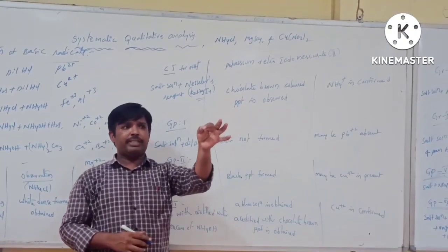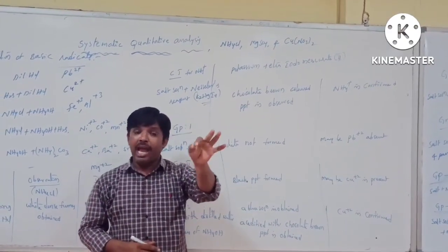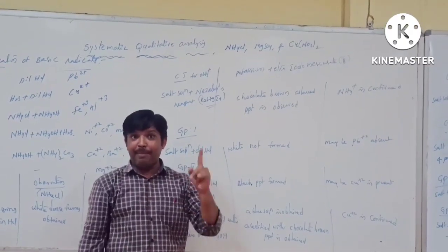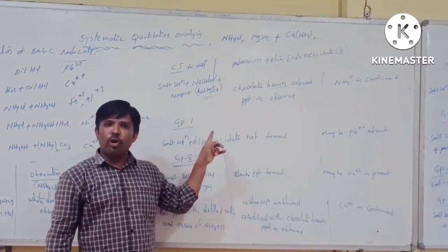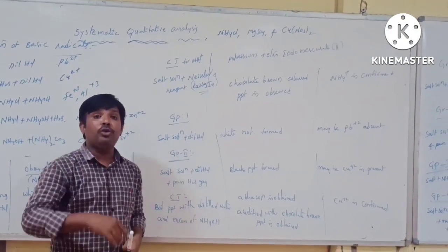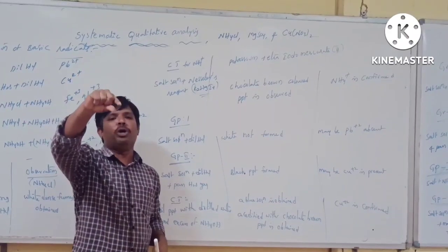Okay, same test tube. White PPT is not formed. In the same test tube you have to pass H2S gas. Same test tube for group 1 and group 2.